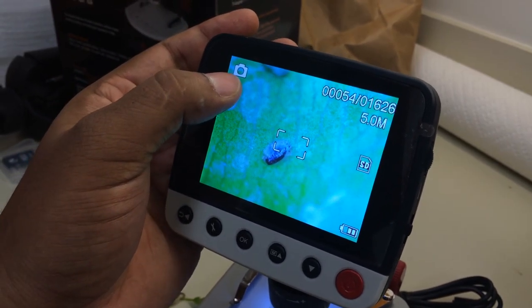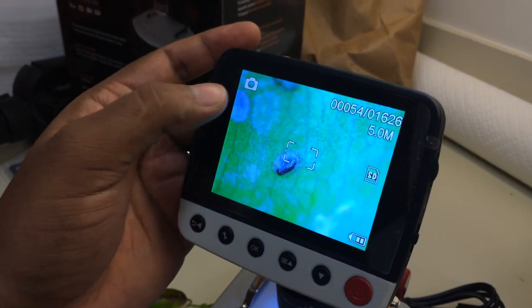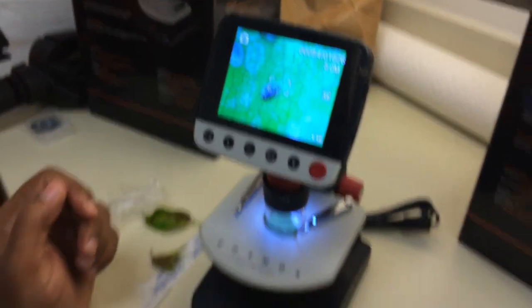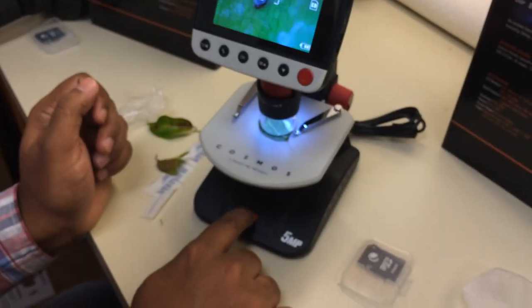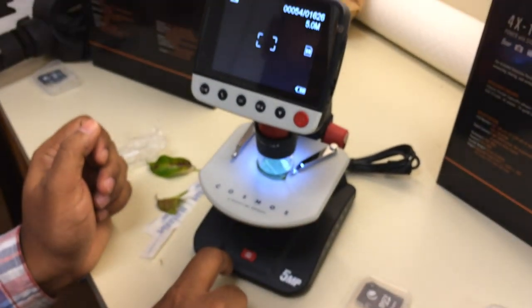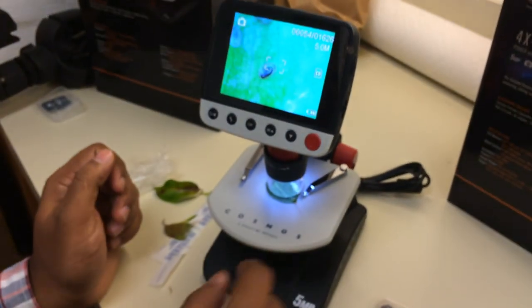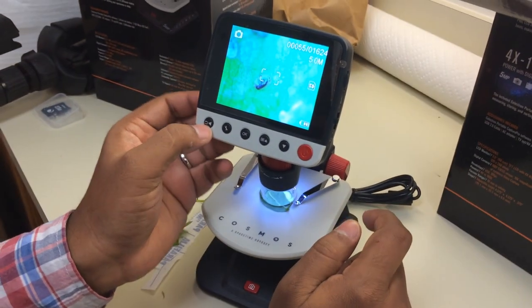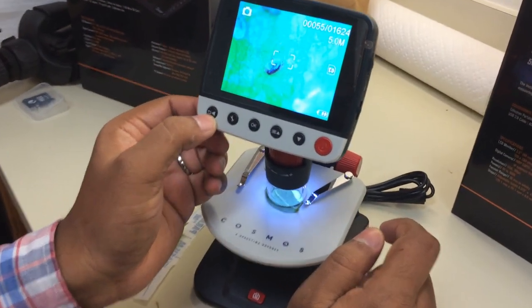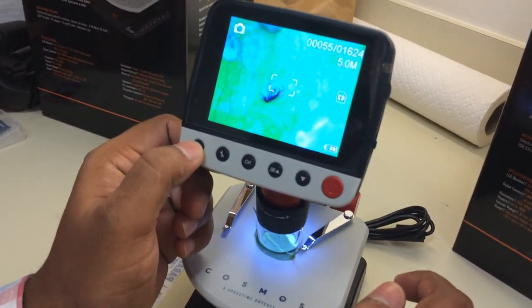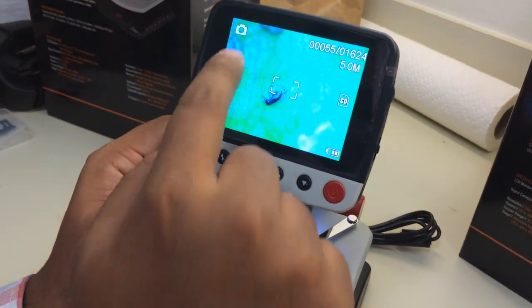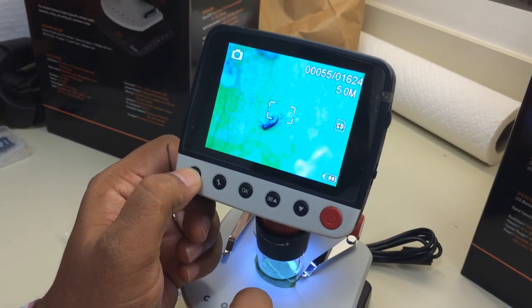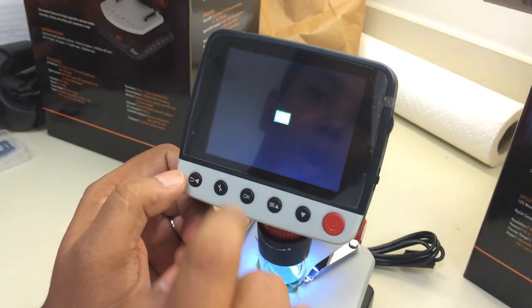It is currently in picture mode, so if you want to take a picture you can just click here and you will get a picture. But if you want to make a video, you have to press this button and you will see this icon change into video camera mode.